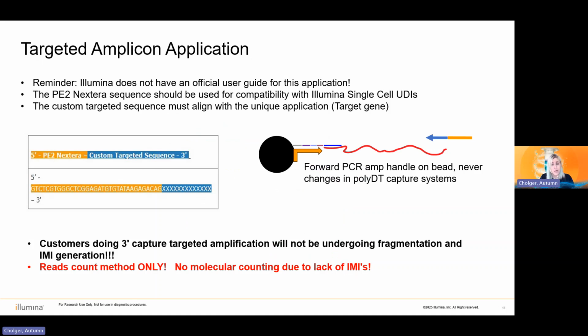And so I know I said earlier that this is not an officially supported use case, but we get enough customers interested in it that I thought I'd talk about it briefly here. This is our targeted amplicon application. I want to start off with a reminder that this is not an official Illumina use case. It does not have a user guide for this application.